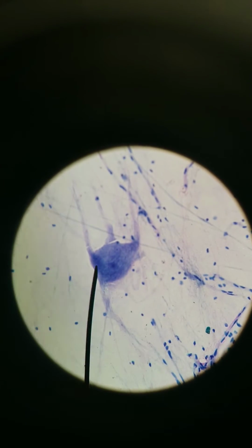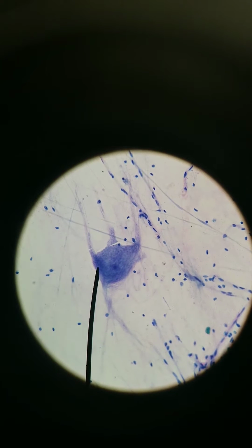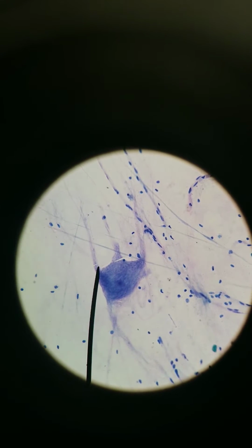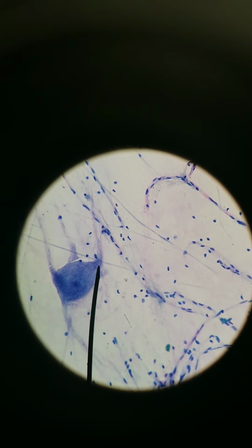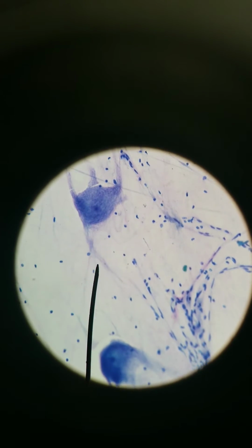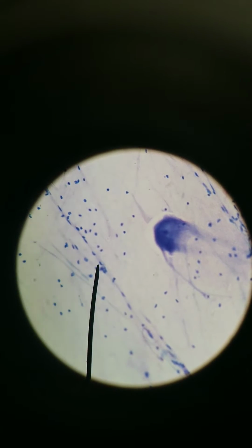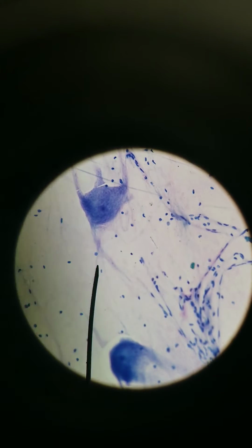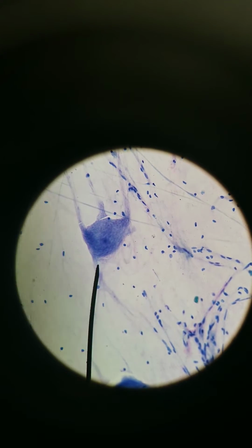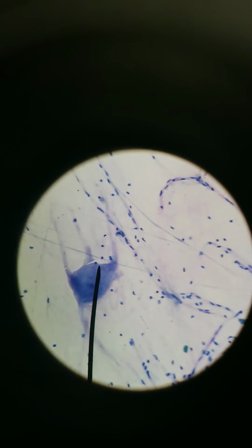Let's switch to another one. Here we go. This one's showing it a bit more clearly. So we have three very visible extensions on the top part. 1, 2 in the middle, 3 over here, and then one extension coming down this way. What you'll notice about this extension that's coming down is that it'll continue and form a kind of chain, like what I'm pointing out right now. What you'll also notice is that this extension is a bit lighter while the other 3 extensions appear a bit darker. So it's almost like it's continuous with the cell body.